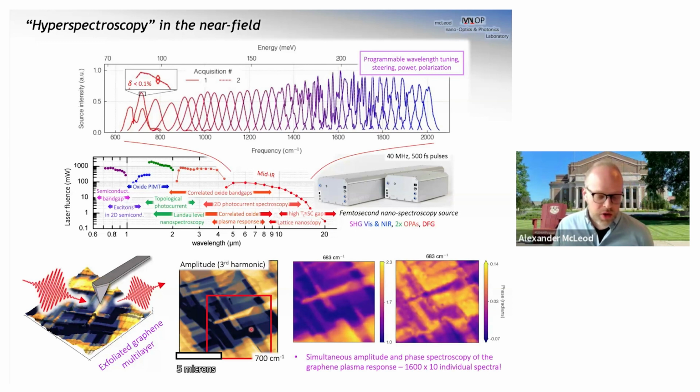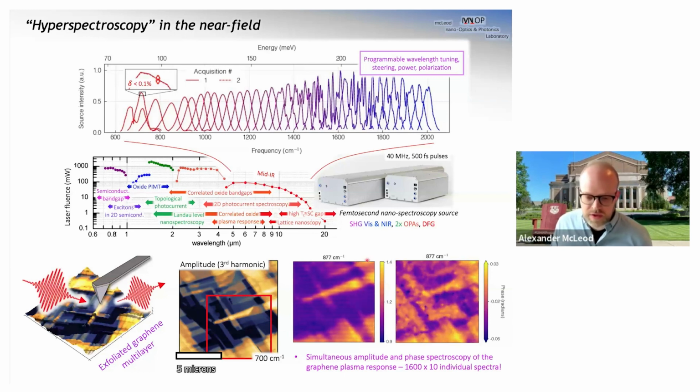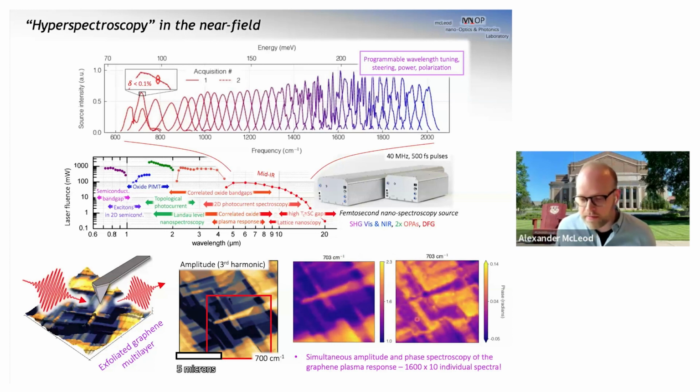Then what we can do is switch from the imaging mode to the spectroscopy mode and measure the conductivity of these graphene multilayers as a function of energy. That's what's scrolling right here. You can see from low energy to high energy, the optical contrasts change selectively in different regions of the material. This is the intensity of the reflected light from the material, and this is the phase, or the absorption of the reflected light, or absorption of the 2D material.